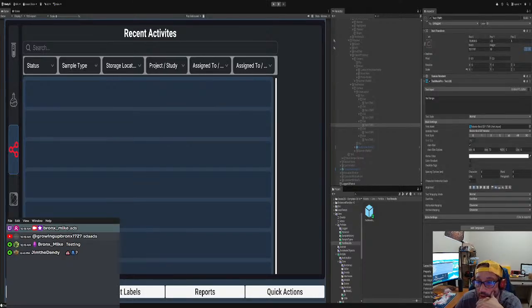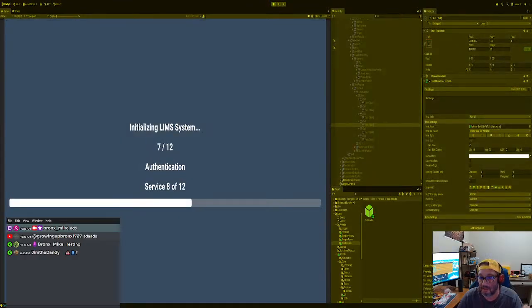All right, so basically on this one, if you wanted to be able to click on, let's say, a test, right, and you want another window to pop up, the data that's in here is what's going to be shown. This script is test results row view, right? And you set the data, and then it goes to result data, and that's what you're going to display in the result data.